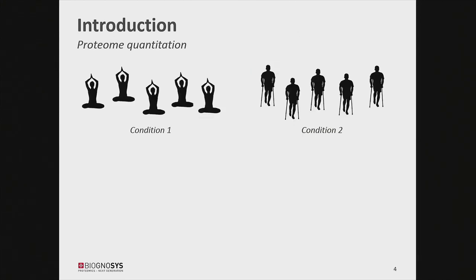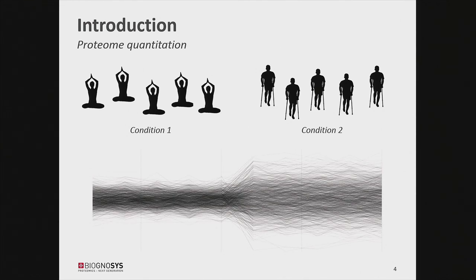So now an introduction about proteome quantitation. Usually, if you want to do quantitative work in proteomics, you have a number of conditions. You already saw the very nice presentation from Olga, so I'm not going to say a lot about the statistics of how you analyze such data. But in principle, you are interested in different conditions and you want to quantitate proteins. If it's DIA, usually it's on a whole proteome or sub-proteome basis, so you want to quantify a lot of different proteins.